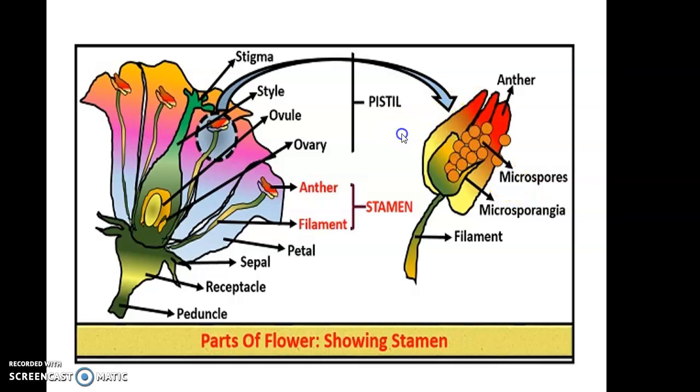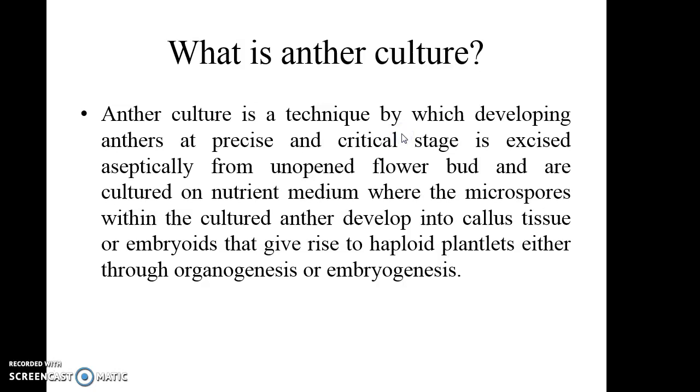So now we will see what anther culture is. To initiate anther culture, you use an unopened flower bud as the explant. You can collect this unopened flower bud from the greenhouse or from the field, collect it in polythene bags, and then take it into the lab.